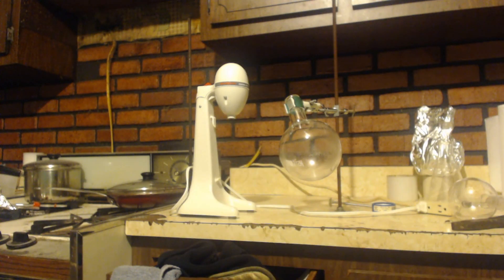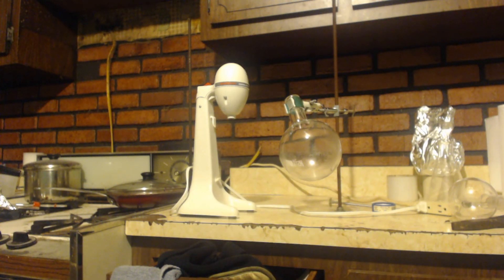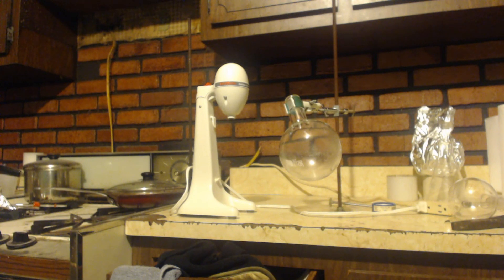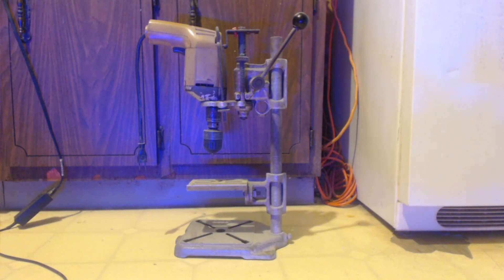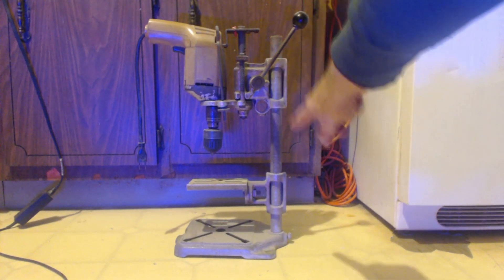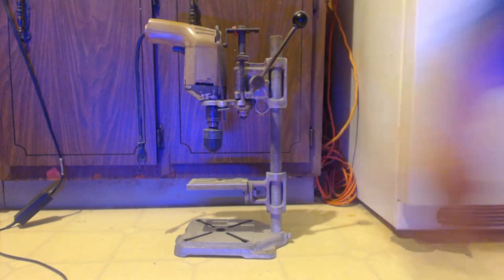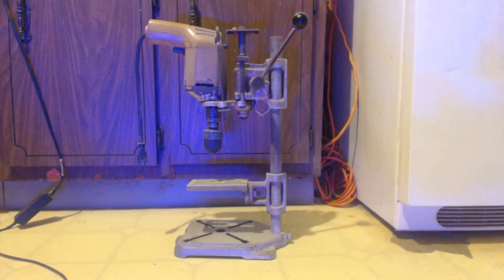In eight hours I think you might burn it out, you just constantly run it for eight hours. Now another idea is to buy a drill press, and you can use this clamp on your round bottom flask or whatever you're going to be using as a vessel.